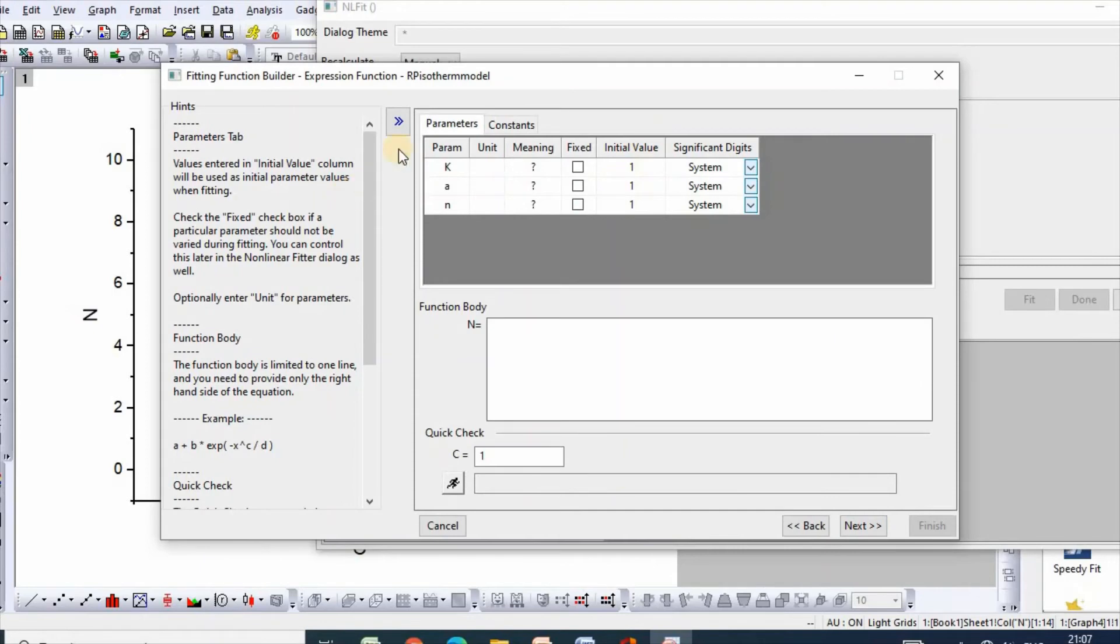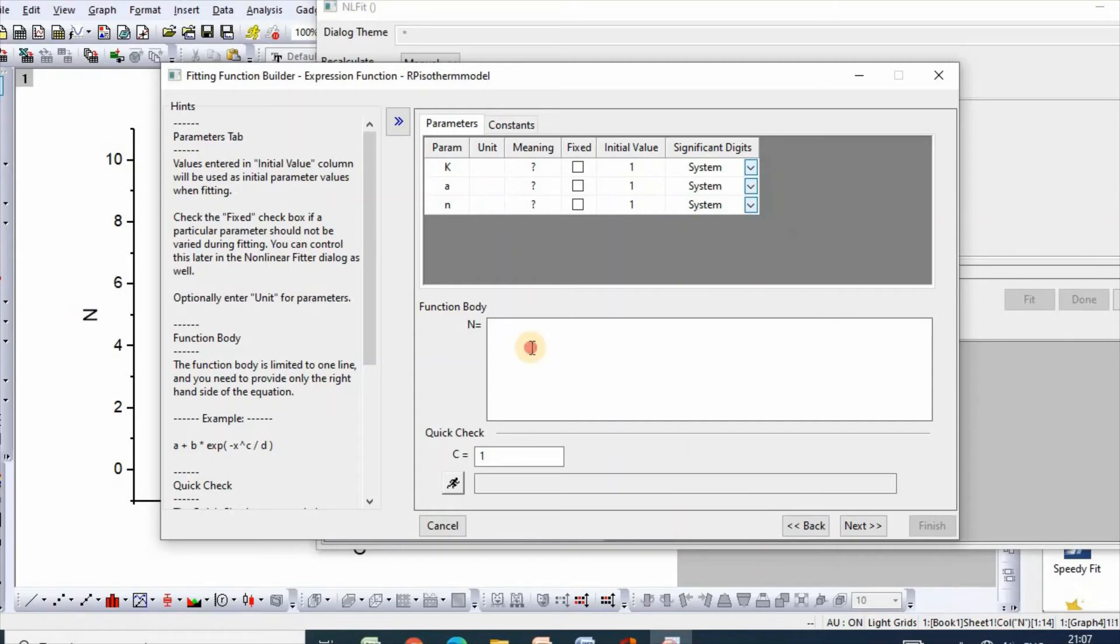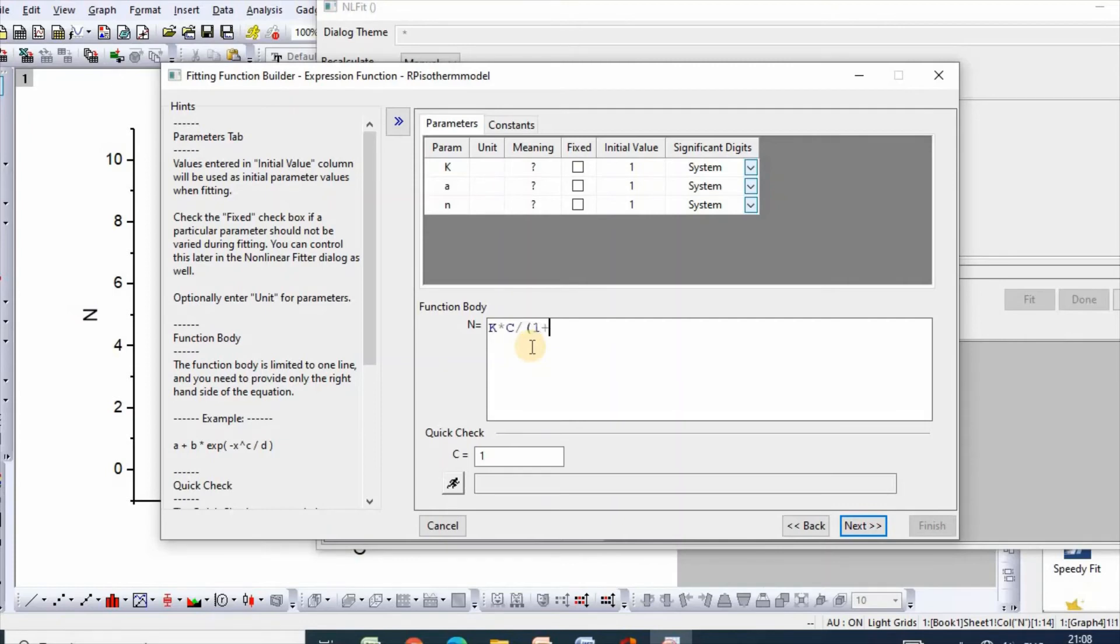Parameters initial value is 1. Then write your function, simply K*C divided by 1 plus a*C to the power n. Here is our function.